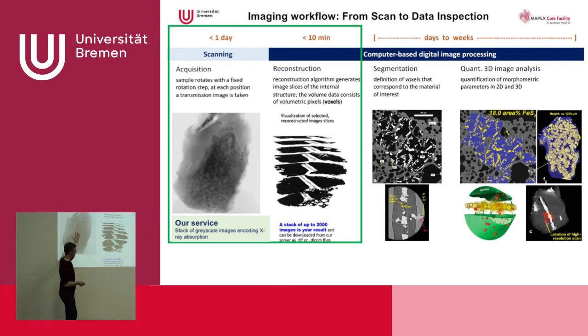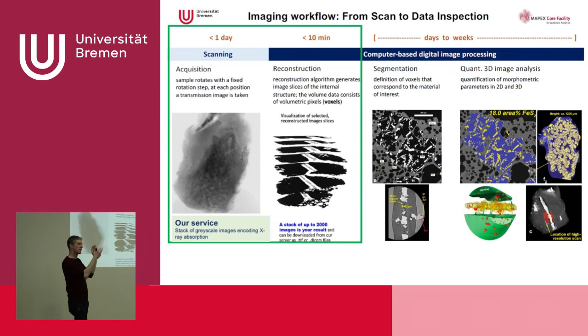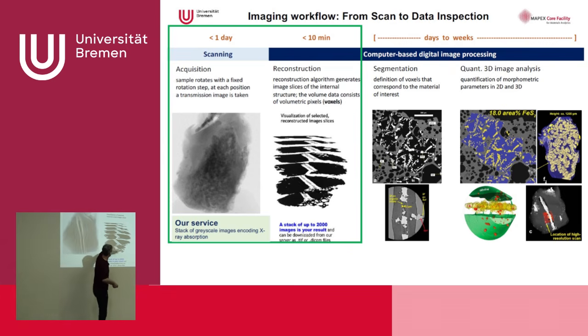We see the object from every side. The computer takes this information and reconstructs a three-dimensional object. And then it produces slice-wise a stack of images that has now the X-ray absorption color-coded from dark to light. And we see this kind of data volume.